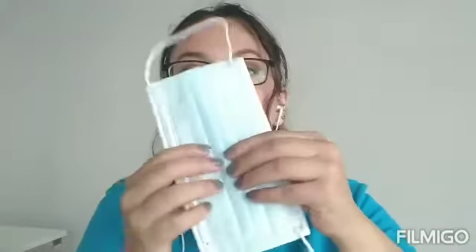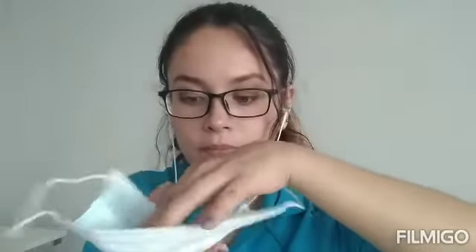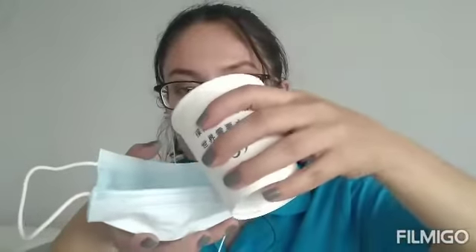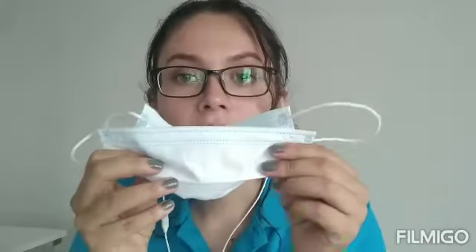The next test that we are going to do is a waterproof test. Press the outer layer of the mask and form a ball like this. Pour some water on it. Now I'm going to pour some water. If the water does not penetrate the outer layer of the mask, it means that this mask is functioning correctly, and it will play its protective role as it should.